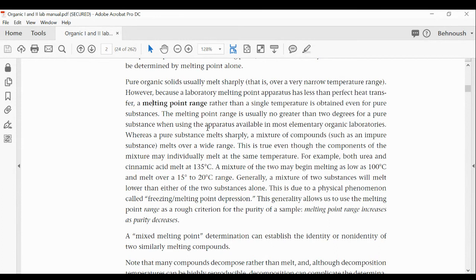What is going to happen at that point? What are you going to do at that point? Can you take the capillary tube out? Can you reuse the capillary tube? Anifal, can you tell me if you can reuse the capillary tube? No. You cannot.